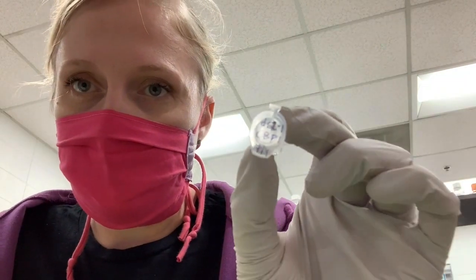So first I'm going to add my master mix to each tube. I've labeled all of these tubes DS for double-stranded RNA, and then something about the gene name. You can number them, you should have the date, and so on. So now I'm going to pipette the master mix into each tube. I'm just doing this on a rack on my bench.